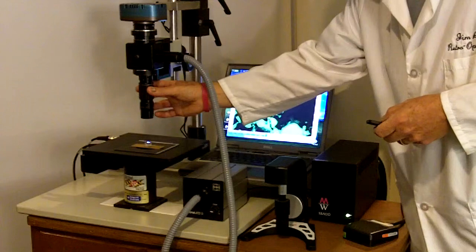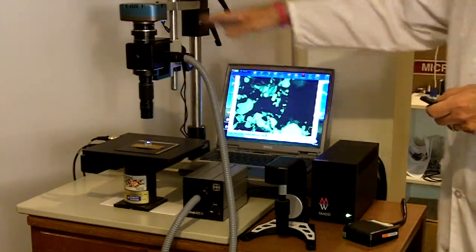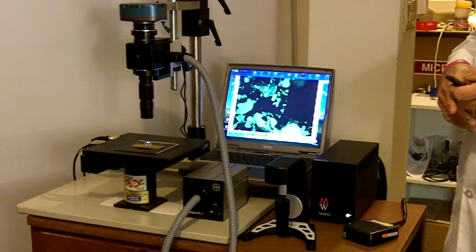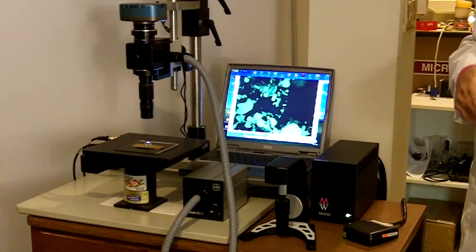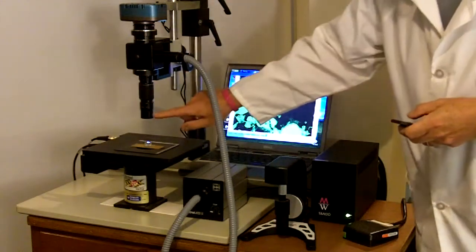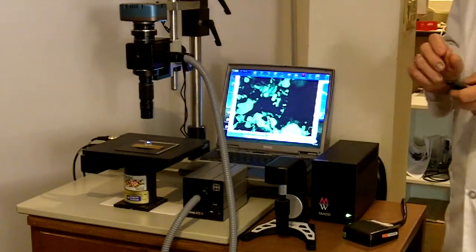We've gotten the field of view that we require by positioning the microscope anywhere from about a half inch to infinity. The front optics available for this instrument are astounding.